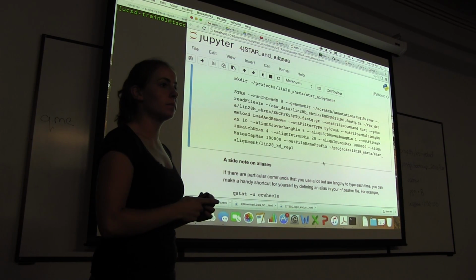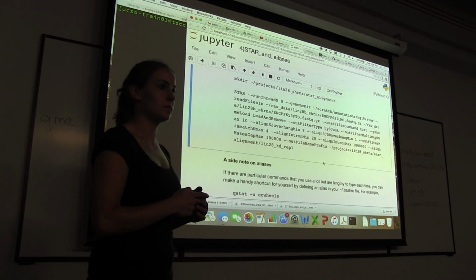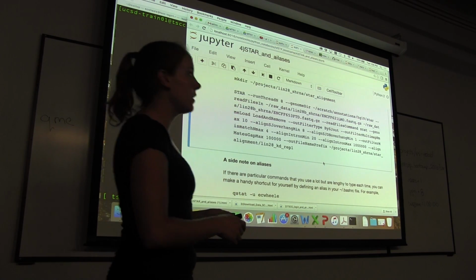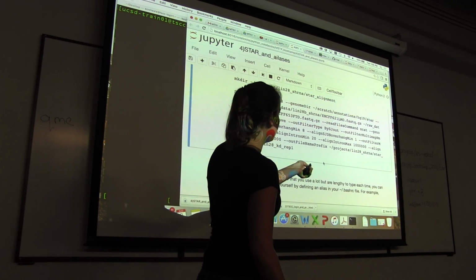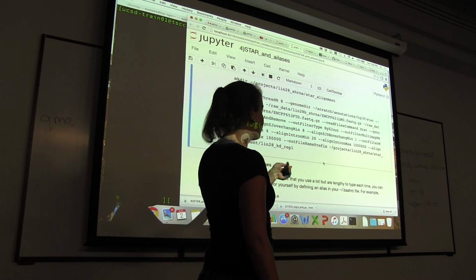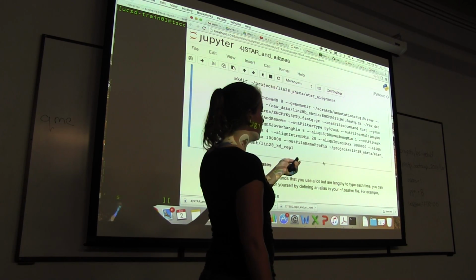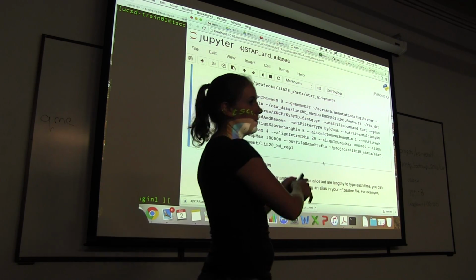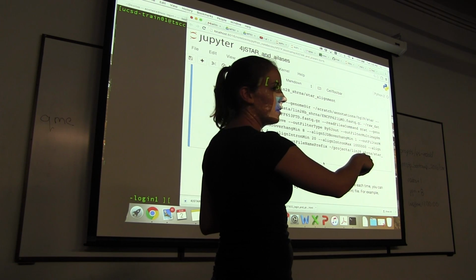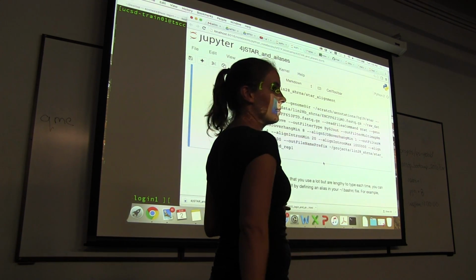When you're writing the command lines, can you specify a wildcard for all the FASTQ files in this directory? No. For STAR, we need to specify that this is the FASTQ file, this is read 1, and this is read 2. I don't think STAR will let you use a wildcard because it needs to have it in a very specific format for this particular alignment. It wants read 1 to come first, and read 2 to come second.